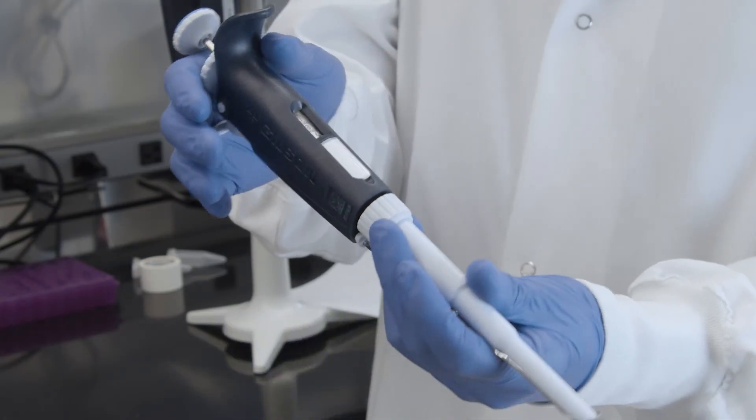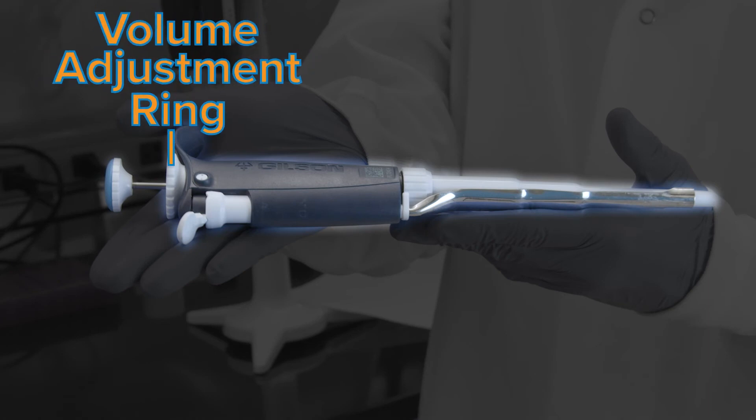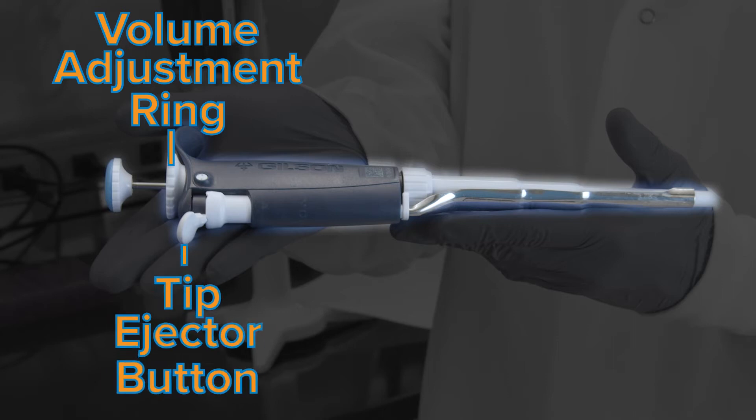Turning the pipette onto its side, you'll see the volume adjustment ring. This is what you'll use to set the volume of the liquid the tip will hold. Next, you'll see the tip ejector button, and further down, the tip ejector itself. This is the mechanism that physically pushes the tip away from the pipette for those easy tip disposals.